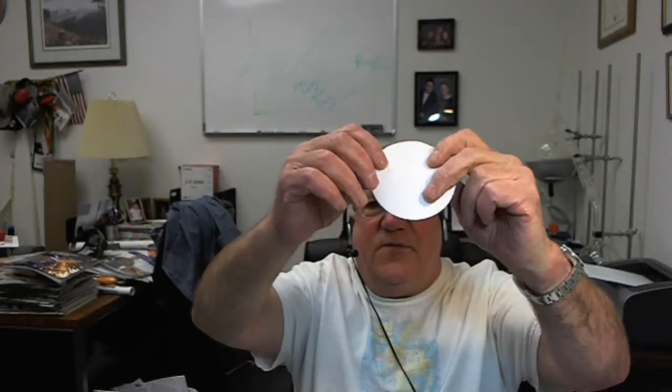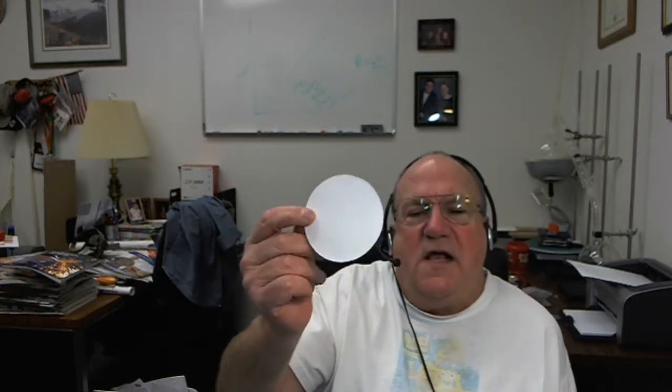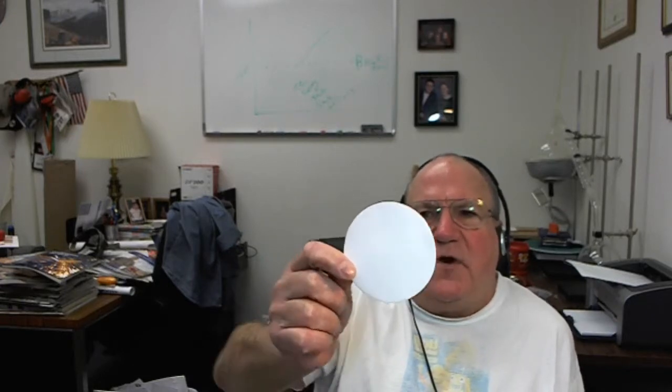The other thing is these are stiff as part of the felting process. If you taste them — and I don't know if you want to taste them or not — quite often they will also have something like a sizing on them. Sometimes it is part of the process to get them to lay nice and flat, sometimes to make them a little stiff. In any case, what you have is a whole bunch of fibers, and the fibers are of varying lengths.